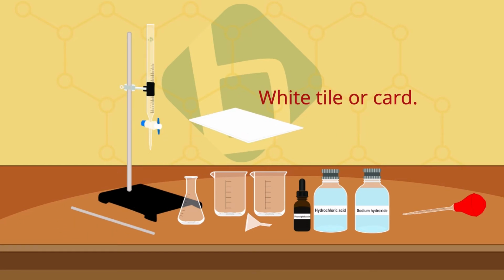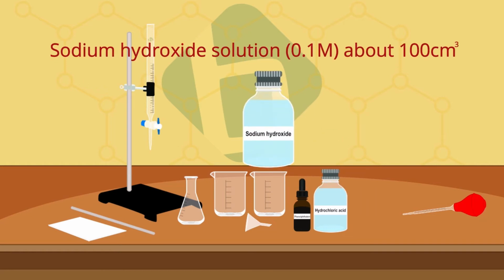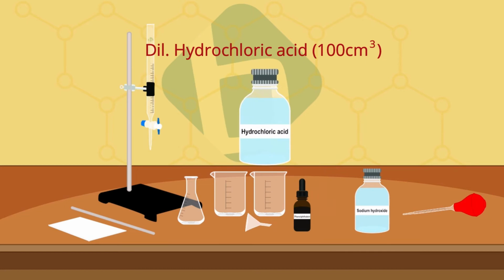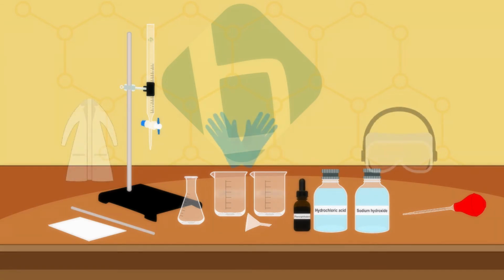which is also optional. The chemicals needed are 100 cubic centimeters of sodium hydroxide solution with a molar concentration of 0.1 mole per liter in a labeled and stoppered bottle, 100 cubic centimeters of dilute hydrochloric acid in a labeled and stoppered bottle, and phenolphthalein indicator solution or an alternative in a small dropper bottle.